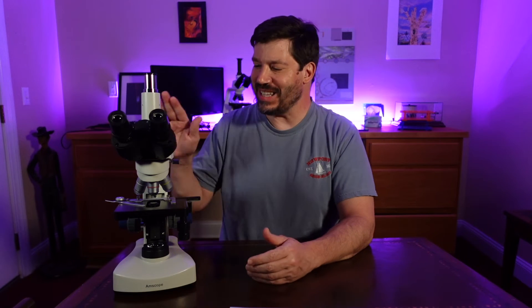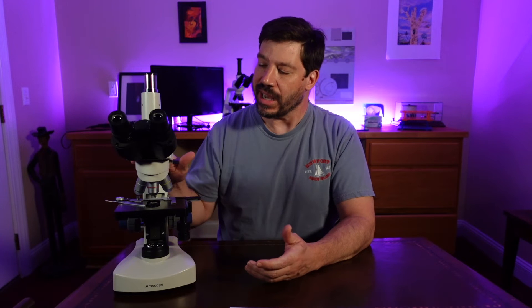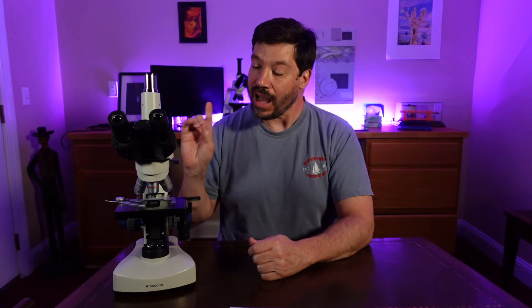Hello and welcome to Zoom In. This is the Amscope T340 Compound Light Microscope — a really nice microscope that can be purchased for as little as $349 at amscope.com. I've made an enhancement to it, and in this video I'll tell you what the nature of that upgrade is, what the cost is, and what the impact is. So let's zoom in and check it out.